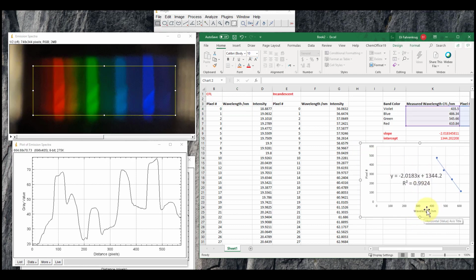On this x-axis, y being the pixel number. So I need to take the pixel number from this column of data, insert it for y, solve for x. So I will say equals, I'll put a closed parentheses. You don't really need it, I just do it for fun.